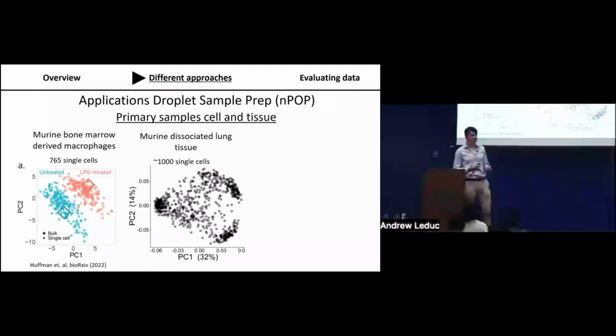We've done tons of experiments where we've taken suspensions of cells and stored them in liquid nitrogen and then brought them up and immediately prepared them. To the extent that you're interested in assessing relative differences between samples and you handle all these samples equally, this can be a really successful way to go about handling your samples.